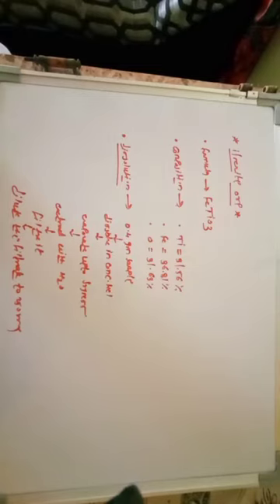First, the most important thing is dissolution of the ore. Take 0.4 to 0.5 gram of sample of ilmenite ore, dissolve in a proper amount of concentrated HCl, and evaporate the solution up to dryness.